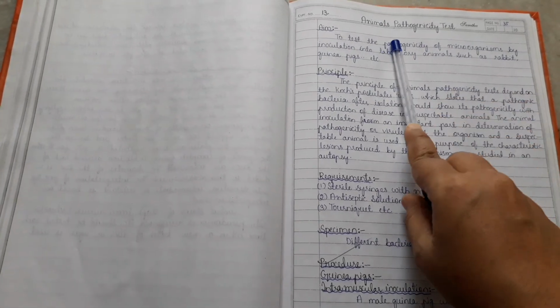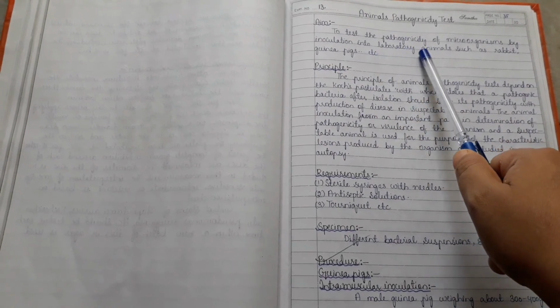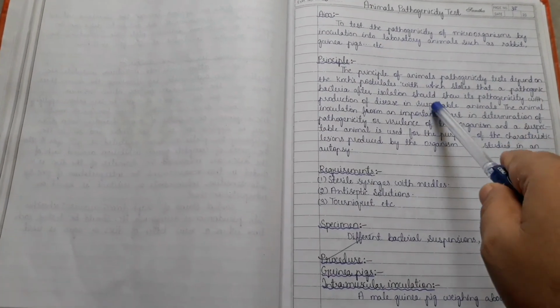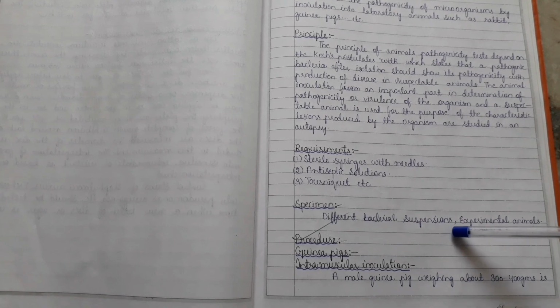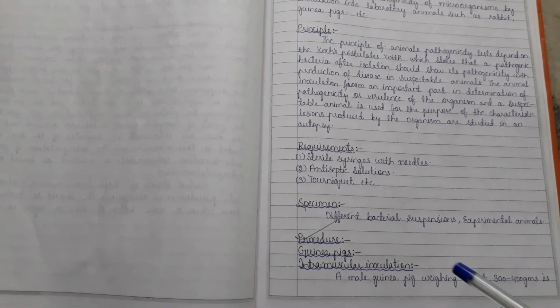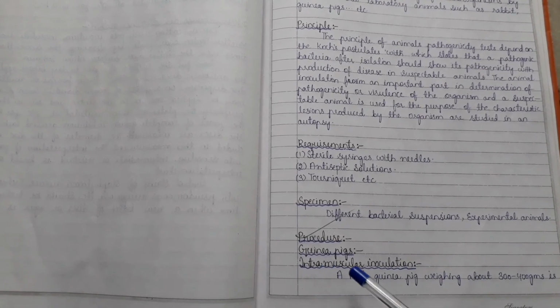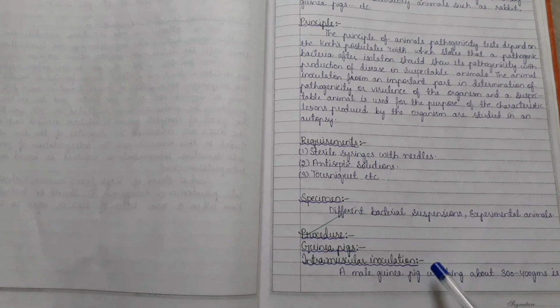So, the animal pathogenicity test is used to test the pathogenicity of microorganisms by inoculation into laboratory animals such as rabbits, guinea pigs, etc. So yeah, this is the principle and the requirements. The specimen we take is different: bacterial suspension and experimental animals. So coming to the procedure, in guinea pigs, intramuscular inoculation is done.